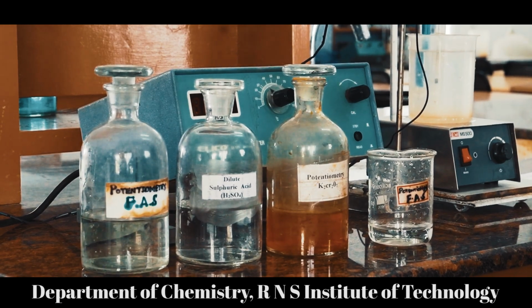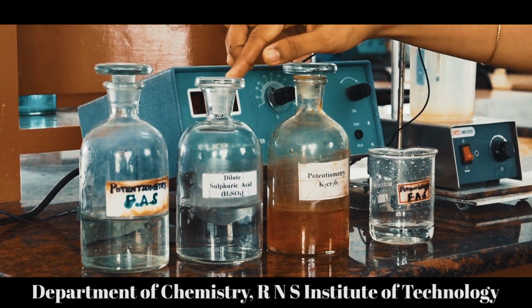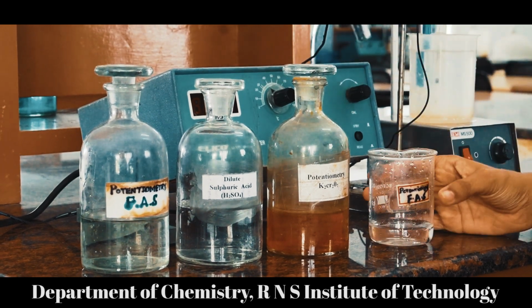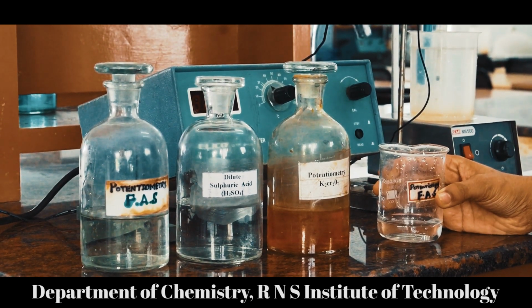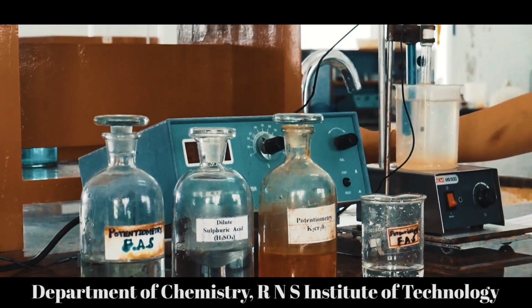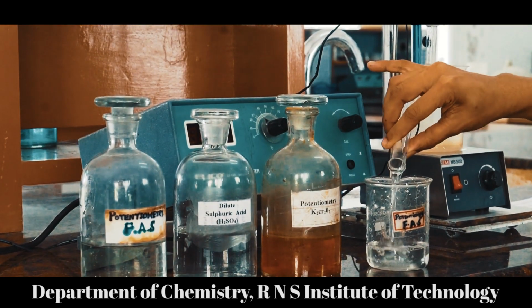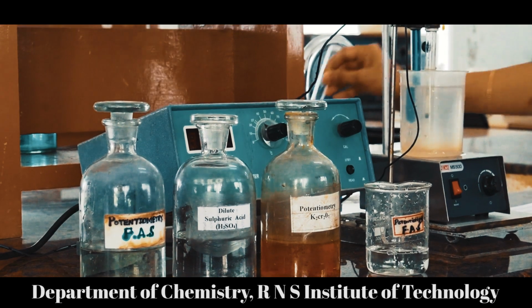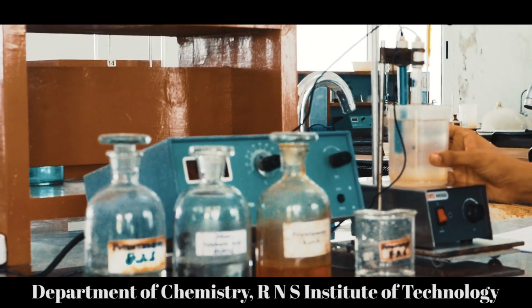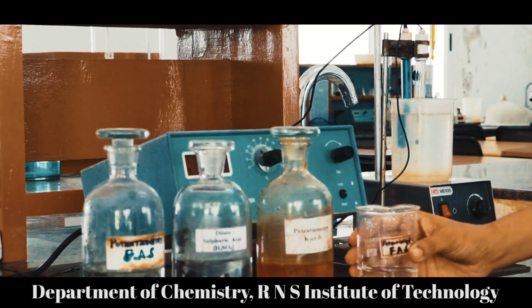The solutions required for this experiment are FAS solution, dilute sulfuric acid and K2Cr2O7 solution. In the beaker, we have taken 25 ml of FAS and a magnetic bead. To this solution, we have to add one full test tube of sulfuric acid. This solution is placed on the magnetic stirrer and the electrodes are dipped in the FAS solution.